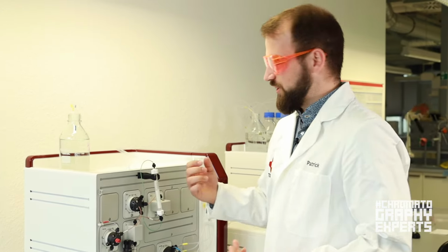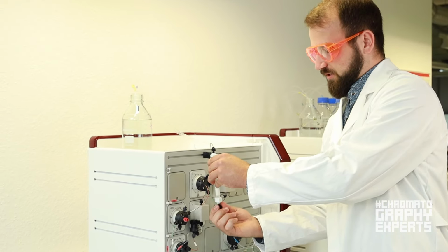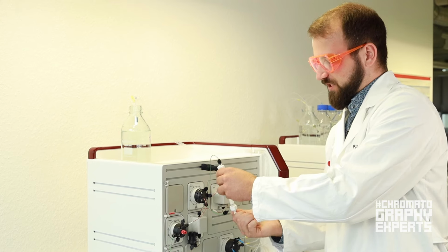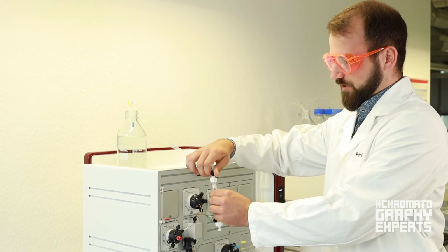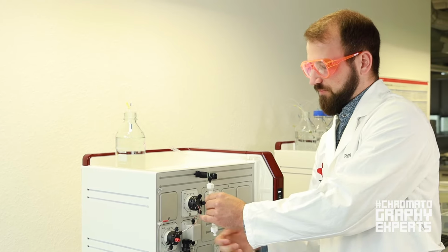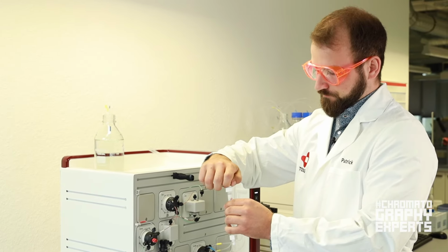To remove the column, we just do the process the other way around. So removing the bottom tubing, sealing or slightly sealing the lower end, so not yet completely tight. Then we remove the upper tubing, just slightly, and then we completely close it on the bottom part. Then we remove the top tubing and close up the top end of the column.